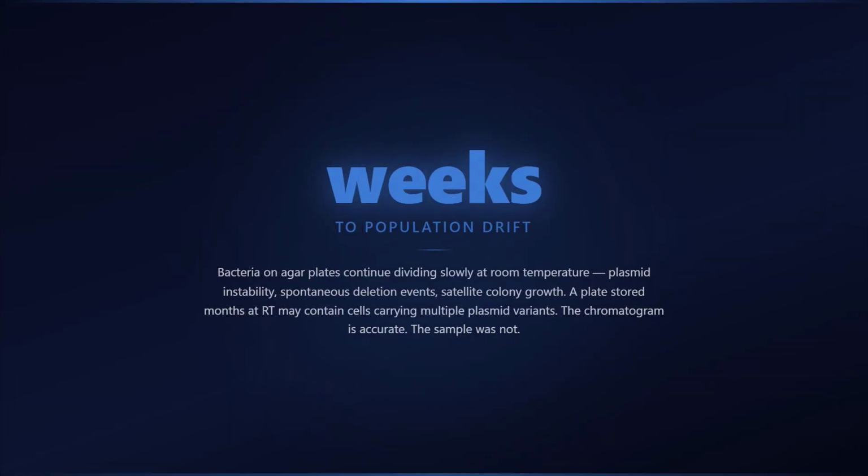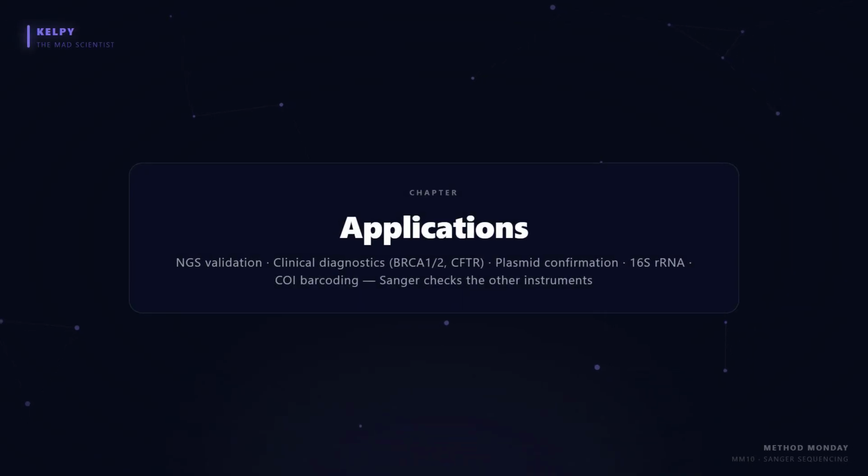Bacteria on an agar plate at room temperature continue dividing slowly and accumulate mutations over weeks to months. Plasmid instability, spontaneous deletion events, and satellite colony growth all contribute to population heterogeneity. A mini prep from a plate stored several months at room temperature may contain cells carrying multiple plasmid variants. The sequencing reaction reads all template molecules simultaneously. Every position where variants differ appears as a double peak. The chromatogram is accurate, the sample was not.